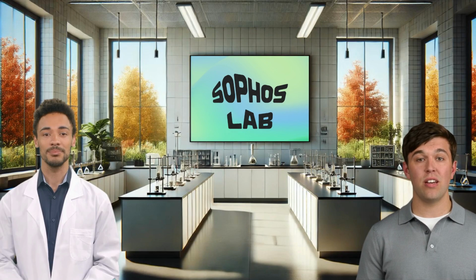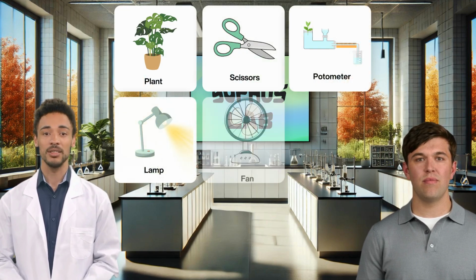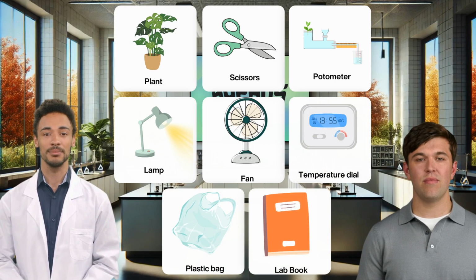Before we get started, let's quickly review the equipment we need. Sam, take us through the list. For this experiment, you will need a plant, some sharp scissors, a potometer, a lamp, a fan, a temperature dial to change the room temperature, a plastic bag, and finally, a lab book.